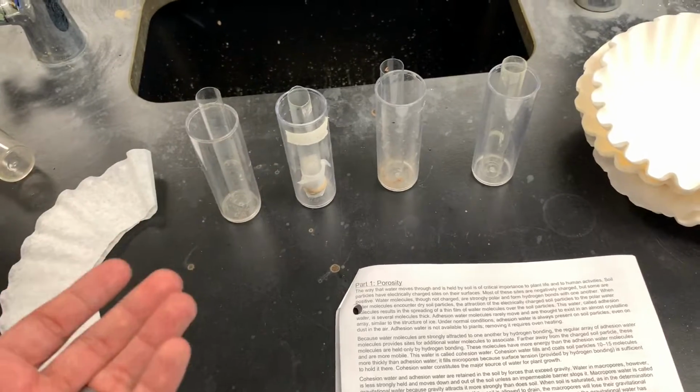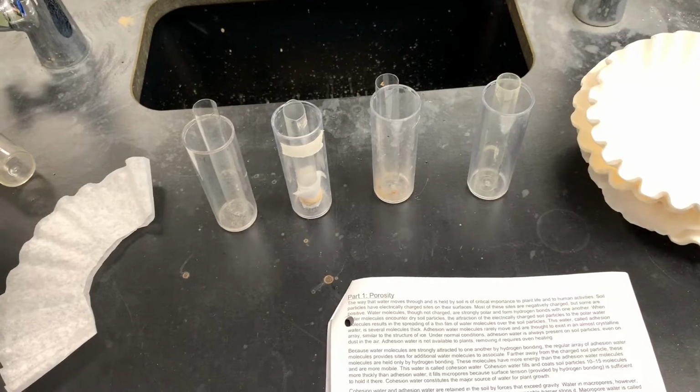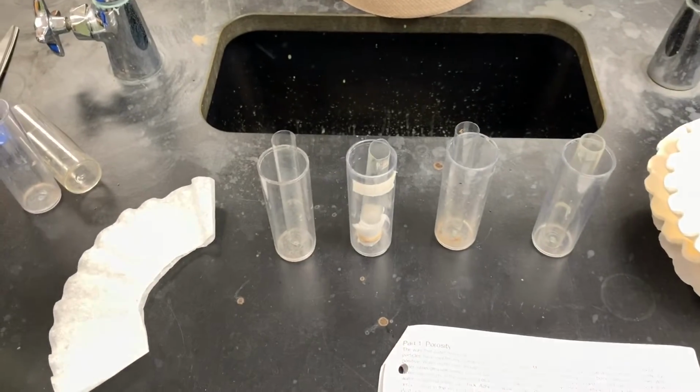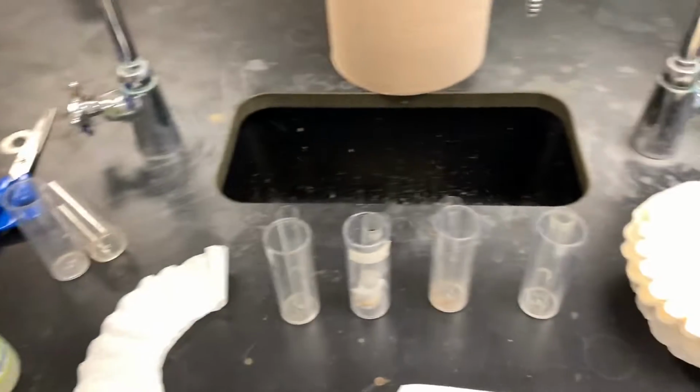And then that's it pretty much, and you'll have all 4 of these, and we'll set them somewhere and let them sit until the next day. The next day we'll come in and it will have absorbed some of the water, and so we'll be able to measure on the scale the new weight and figure out how much water each one absorbs.